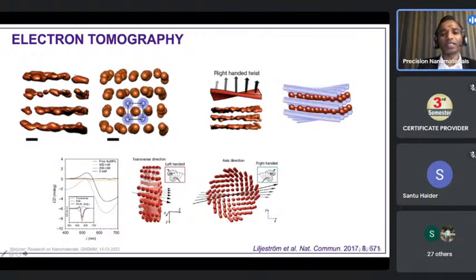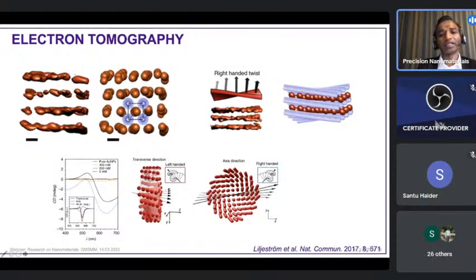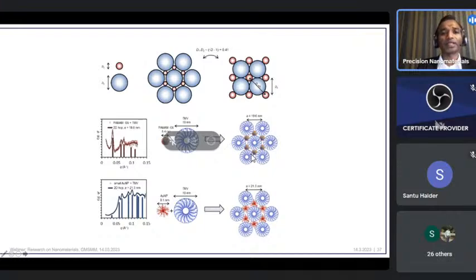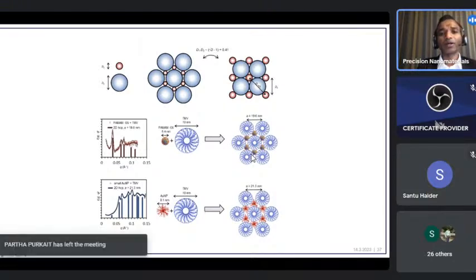It provides support for small-angle X-ray observation and support, for example, for computational simulation and also design. Here we show how the nanoparticle virus rod-like structure depends on the size of the nanoparticle. If the nanoparticle is smaller, then of course the difference is bigger, and then it gets smaller.